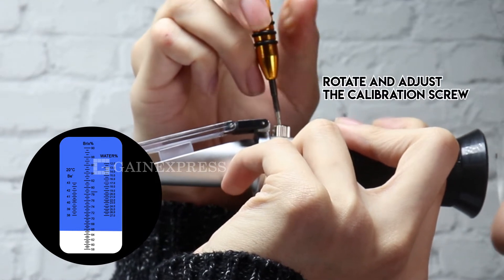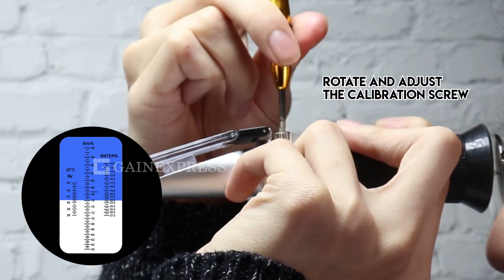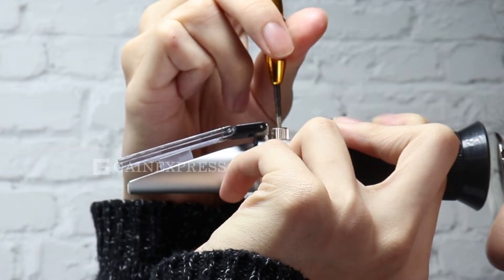Then rotate and adjust the calibration screw to make the light and blue boundary coincide with the reference line at Brix 78.8%. The calibration process is now done.